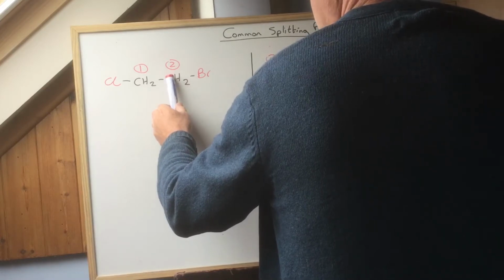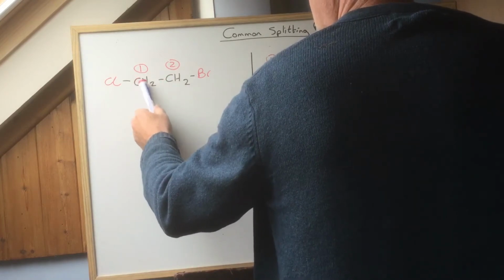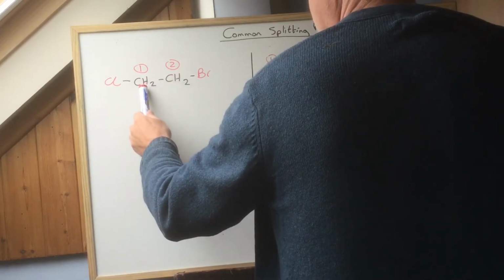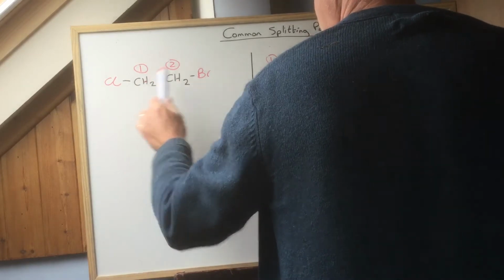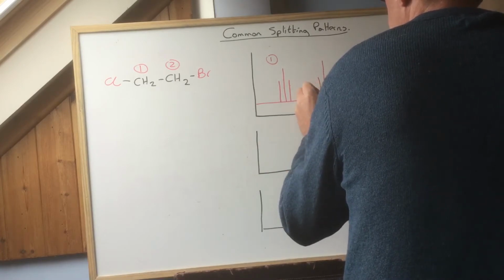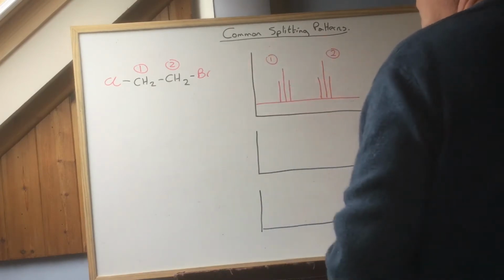joined to a carbon. Right, yeah, fine. Is there an adjacent carbon? Yes, there is. Does that adjacent carbon have protons on it? Yes, it does. 2. So N is 2. So those 2 here are going to be split by those adjacent protons. The peak here is going to be split by those 2, n plus 1 into 3. In other words, 2 triplets, classic splitting pattern, doesn't matter which way, 1, 2, 2, 1, doesn't matter which one.